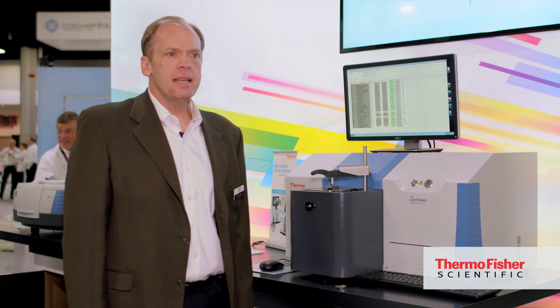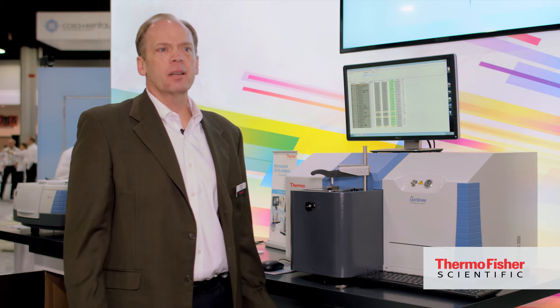We're looking at the Thermo Scientific ARL EasySpark Optical Emission Spectrometer today. Our customers are very demanding in terms of the precision of their analysis, the accuracy, stability, and long-term reliability of our instruments.